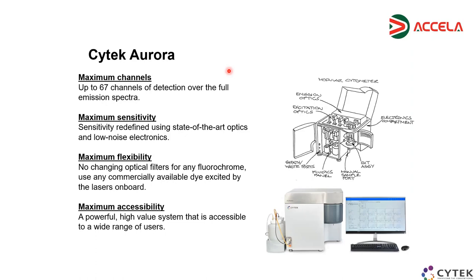And the second one that you mentioned, the software of the machine. Should we buy the analyzing software alone, or is it included in the total price of the machine? With the machine, we can discuss the license. I think it's included, and this is acquisition and analysis software. But of course, there are different options. There are users who like to post-process using FCS Express, FlowJo.